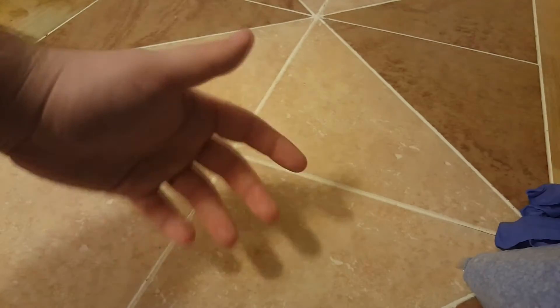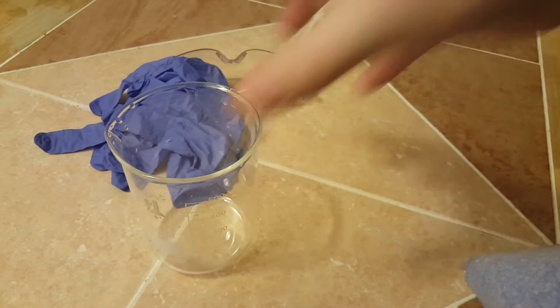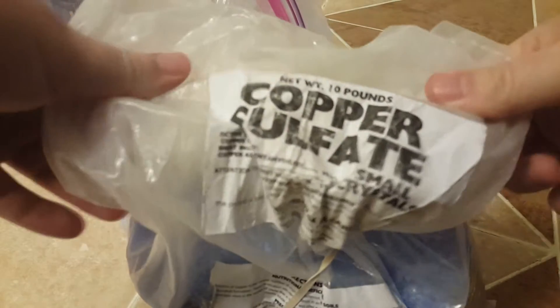Hi everyone. Today I'm going to show you how to make Chevreul's Salt. To do this experiment you're going to need goggles, gloves, some beakers — both glass and plastic. You're going to need a lab scale, sodium metabisulfite, and copper sulfate.